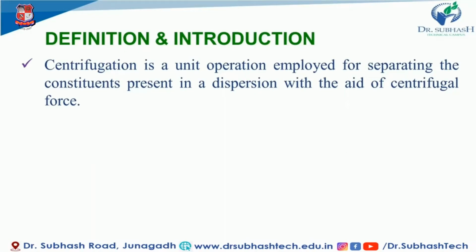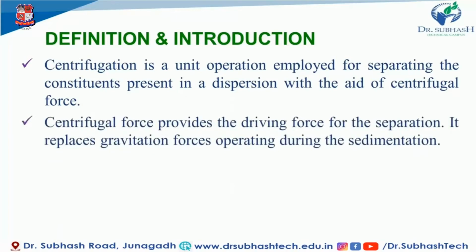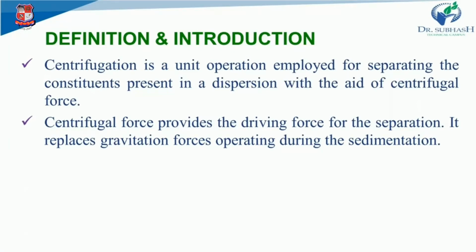I repeat, centrifugation is a unit operation that is employed for separating the constituent present in a dispersion with the aid of centrifugal force. So here what are you using? You are using centrifugal force, right? Centrifugal force provides the driving force for the separation. It replaces gravitation forces operating during the sedimentation, right? So it replaces the gravitational forces.